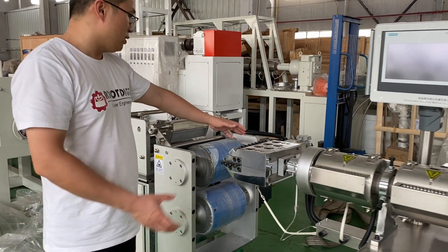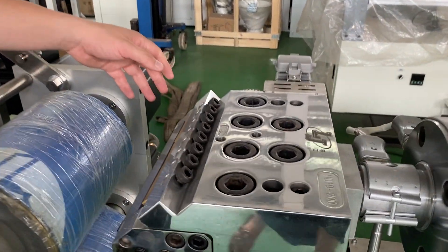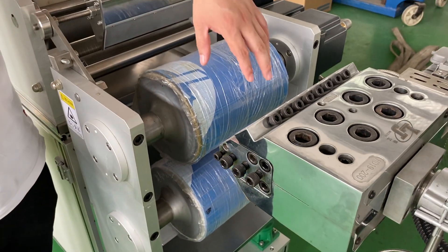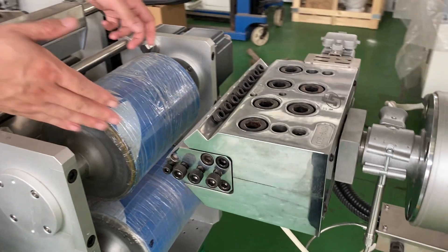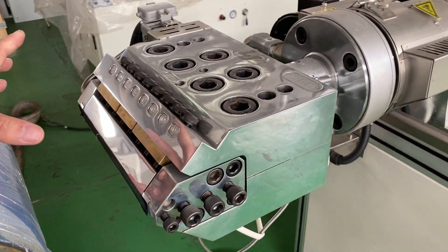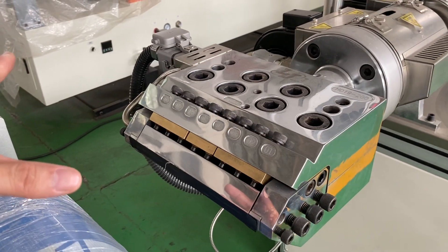So this is the die — we call it the die or the mold. The film comes out from this mold. The size is just 20 centimeters, which is 200 millimeters.